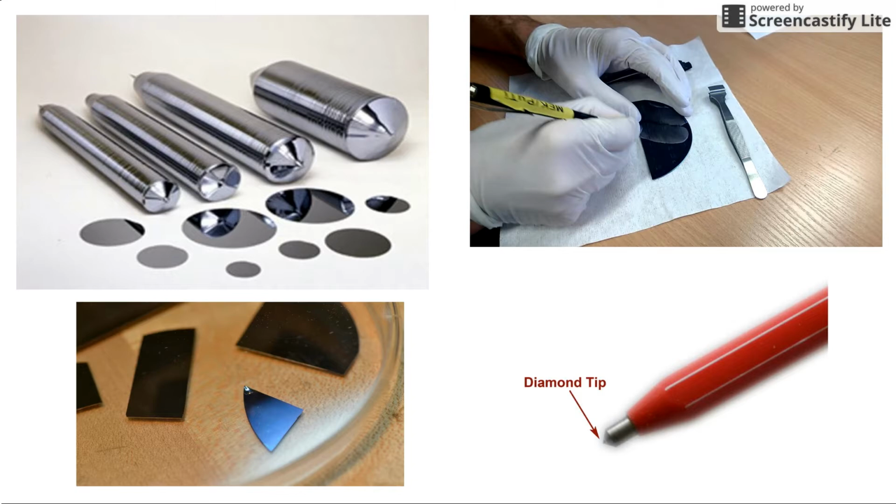Then, using 2 tweezers, grasp the wafer on both sides of the cut and apply pressure downward to cause a fracture. Continue these steps until you achieve the 1 by 1 centimeter squares.